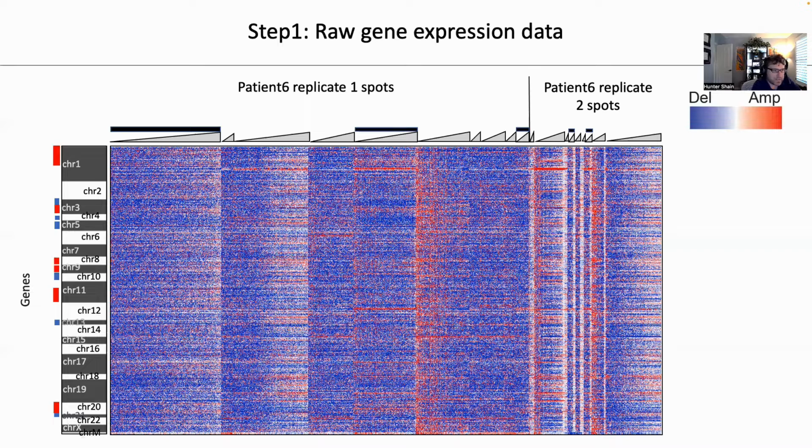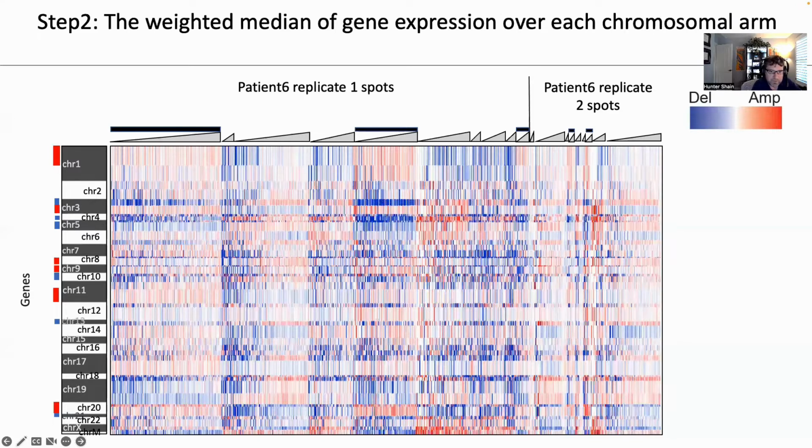Not really. Maybe you can convince yourself, here's a group of tumor cells that could be a deletion of 3p here and a gain of 3q here, but you have to know where to look. It's not easy to appreciate these signals. What happens when we apply CNVkit-RNA? Well, this immediately cleans up the data.